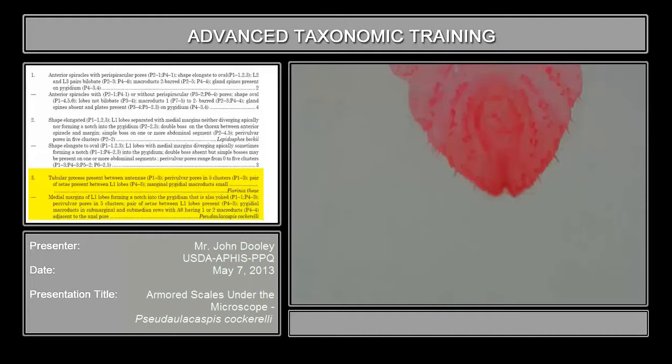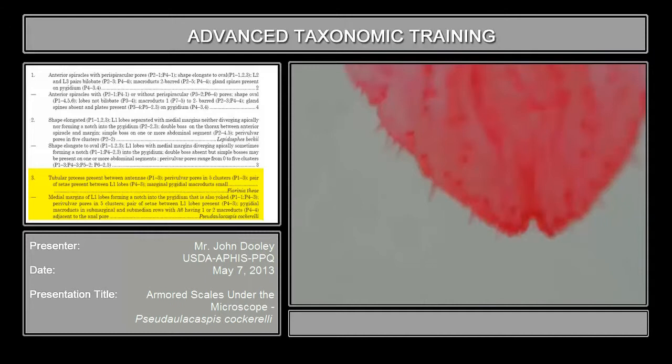Perivulvar pores are again in five clusters. But first, also important: if you look down at the base of your median lobes, you can barely see them here — they're very, very minute, but this is also extremely important. They have a pair of setae coming out of the median lobes, and that is also indicative of this genus. If it doesn't have any setae at all, it's going to be one of two other genera — Chionaspis or Duplachionaspis. Chionaspis and Pseudaulacaspis used to be under the same genus years ago, then they split it. Pseudaulacaspis always has a pair of setae — some very long, some very short — and that's something you'll have to be able to recognize.